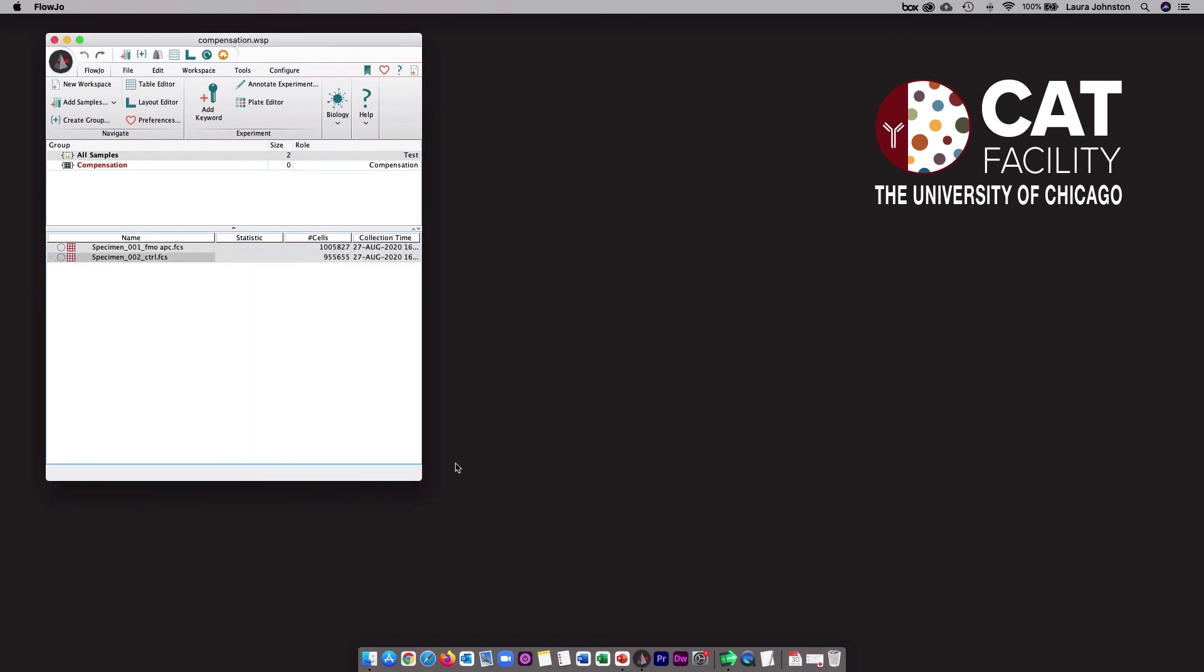The final option is to save the entire workspace. By default, your workspaces will be saved as a WSP file, which means that it's just the workspace and the FCS files are stored separately. This keeps the size of the WSP file small, but it means that if you move to a different computer or send this to someone, it can be a little bit complicated. You'll need to also send them separate FCS files, and then once the WSP file is opened on the new computer, you'll get an error message because you need to tell FlowJo where the FCS files are now located on the new computer.